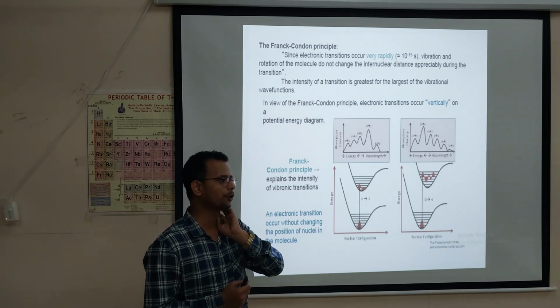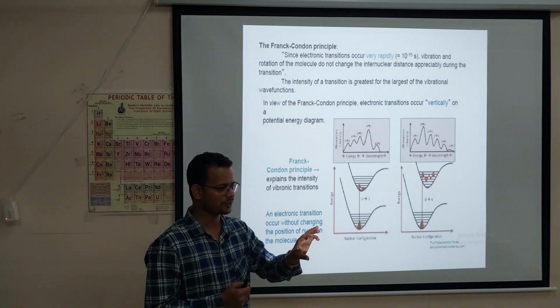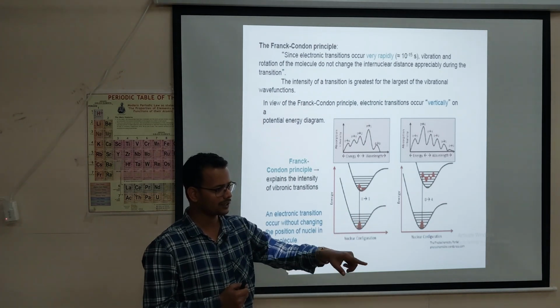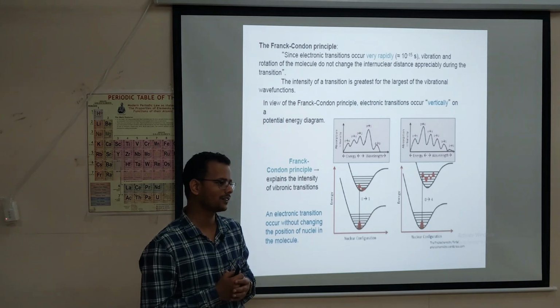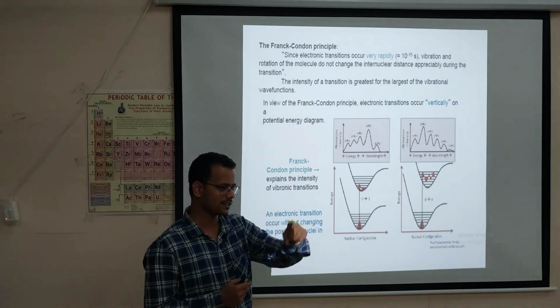If we take hydrogen, then we could excite the 1s electron, but the condition is it should be solid, and hydrogen is a gas. So it is only used for excitation of valence electrons.